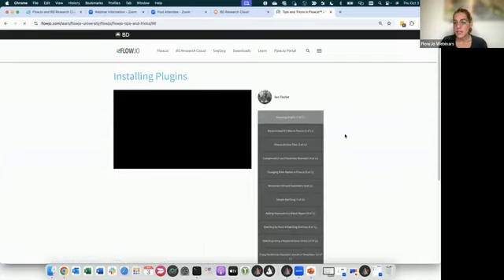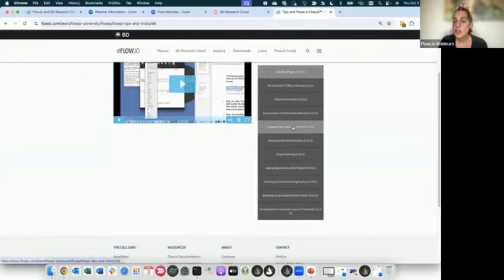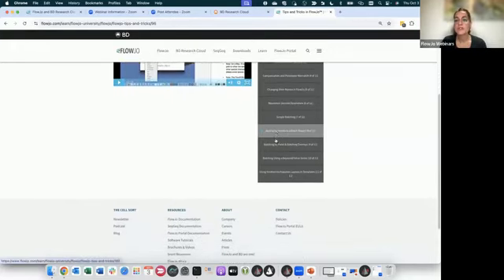There are many tips and tricks that you can find, like many times we cannot find our files in FlowJo. How do we reconnect them? Or what is an archive file? Changing the stain names if I made it wrong, and so on. How do I add keywords and so on?